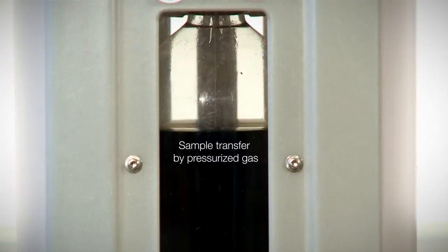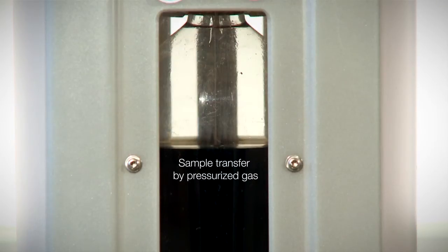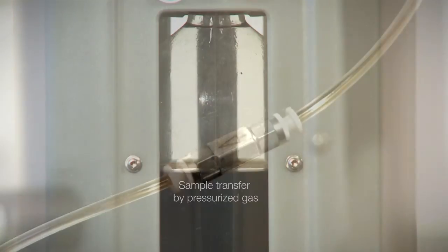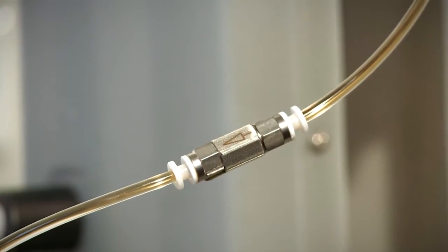PFD induces the sample transfer with pressurized gas. When the sample is transferred from one container into the measuring chamber, no CO2 is lost along the way.